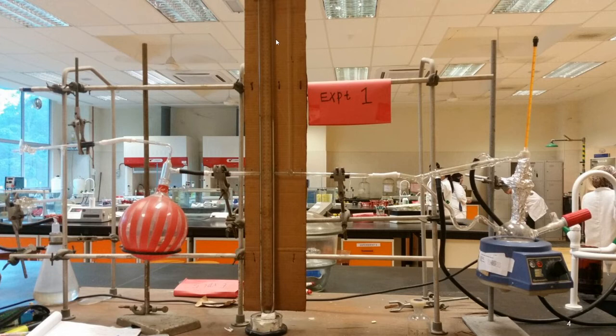That means you have low pressure in the system. To do that, you close the tap for the air and connect it directly to the pump so that it sucks up, and that will increase the mercury level. Then you close the pump and you can start the experiment by boiling.